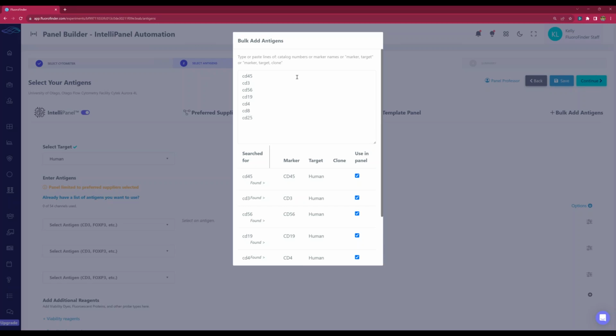Yeah, so what I would recommend doing is what people have to do with the Bigfoot, because there's so many different configuration potentials. You can just load up 2 different instruments and say, this is one configuration and this is the other. It doesn't have to be 2 separate instruments if you have the option to change the filter, and then you can auto load it. But as an individual, your core facility can't let you change the machine on our program, or it would mess it up for everybody else. So only the manager can change it, but that doesn't mean that you can't add new configurations.